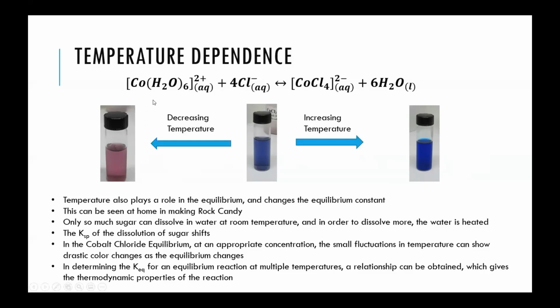So the equilibrium is temperature dependent, and you can measure the equilibrium at each of these 3 different temperatures. You look at the equilibrium constant, and from that you can determine the thermodynamic properties of this equilibrium equation.